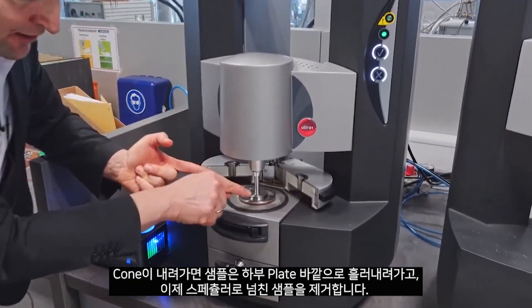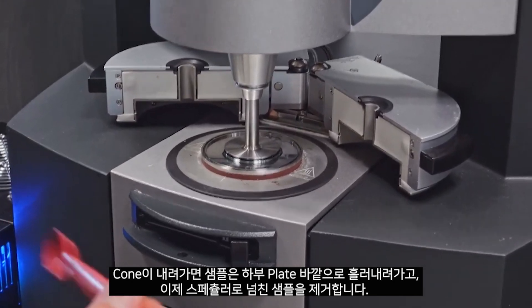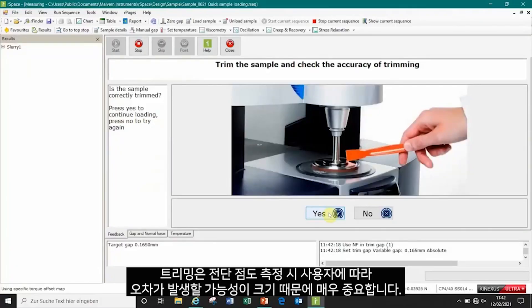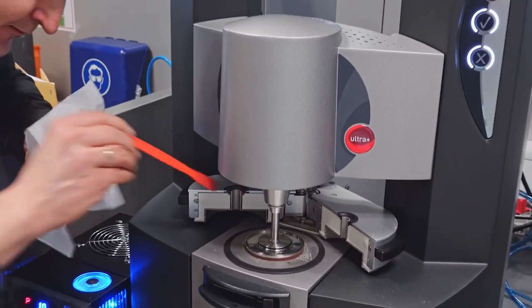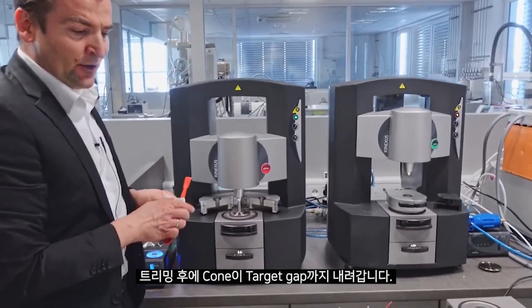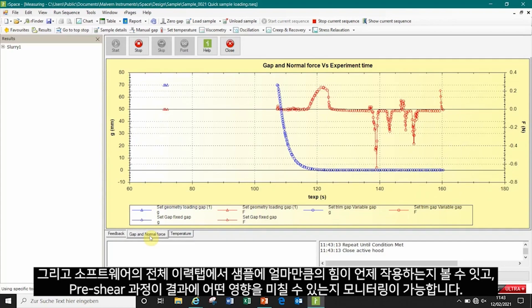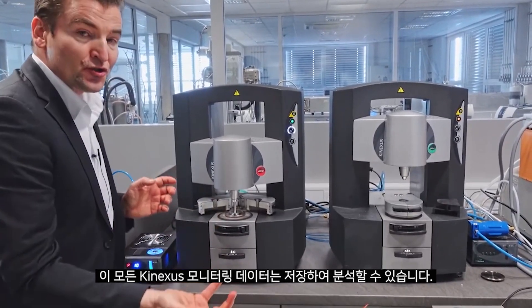I put approximately the correct sample volume onto the lower plate and now I drive down with the upper cone to a trim gap, which is slightly higher than our target gap of 150 micrometers for this cone. We need to take off the excess of material to have a proper filling. You see the sample is getting out of the upper cone, flowing down at the edge of the lower pedestal, and I can take the spatula and remove the excess. This trimming is still the largest error introduced by the user on a shear viscosity measurement.